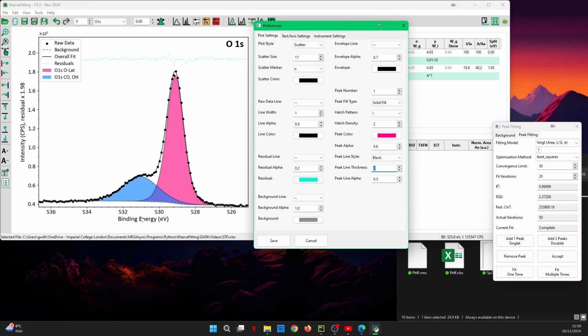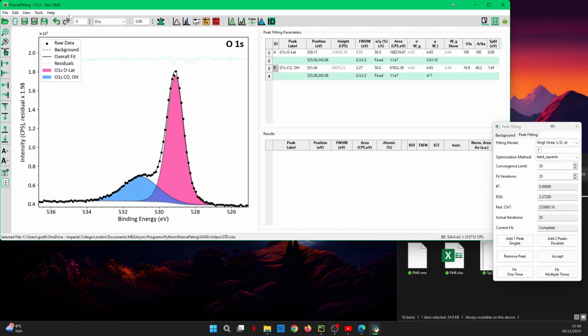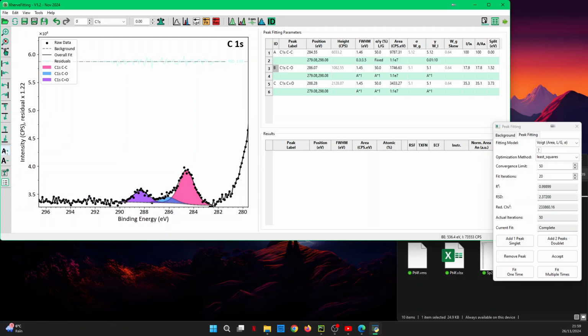If I'm not happy with the font, this time I've got Calibri. And if I want to change the font, you saw where it was, but I also have the possibility to change the font here. And this time they will all change to what you want. And this happens to all plots, so they're all the same thing. Let me just move it somewhere there, something like that.